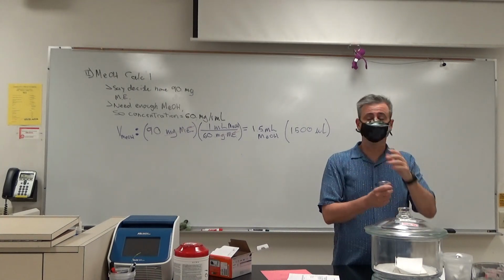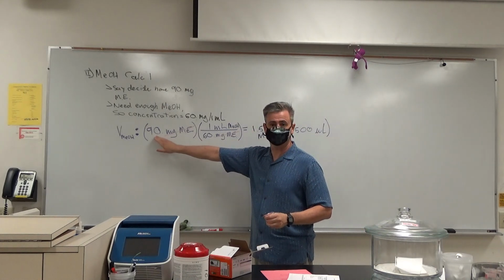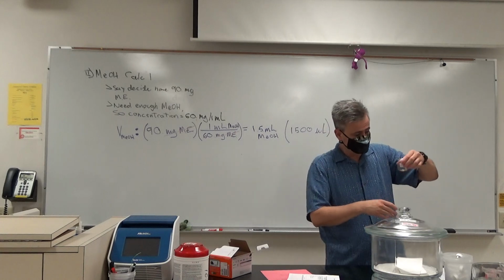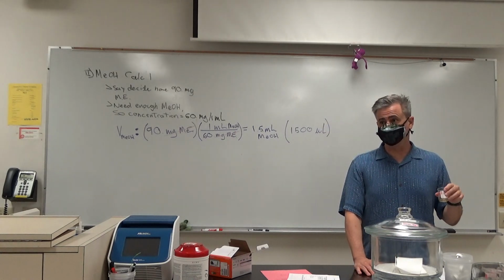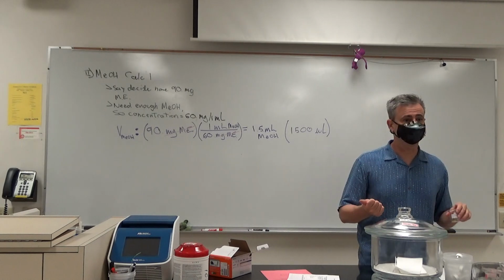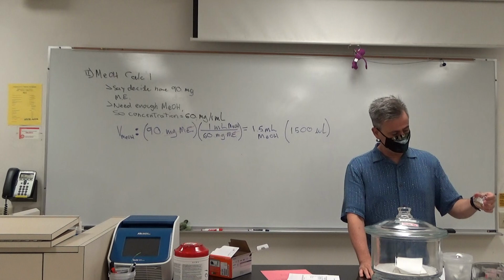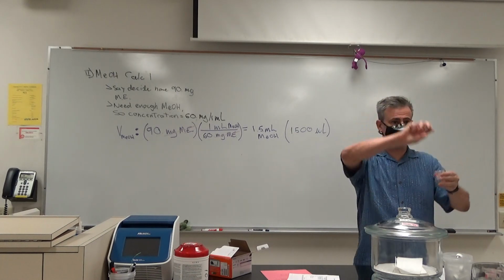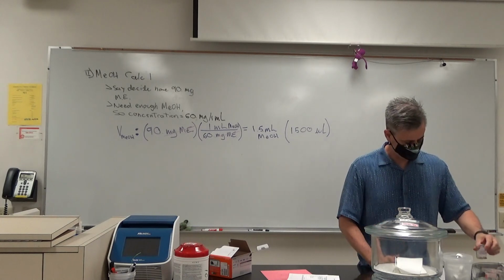Okay? So that's what I will put in. My partner will have done a different calculation because they'll have a different quantity here. They'll use the same ratio, but a different quantity. And you should show me Calc 1 and Calc 2 before you do it, okay, just so we make sure. So I make it up, and then me and my partner combine, and now we can make our terms. Okay.